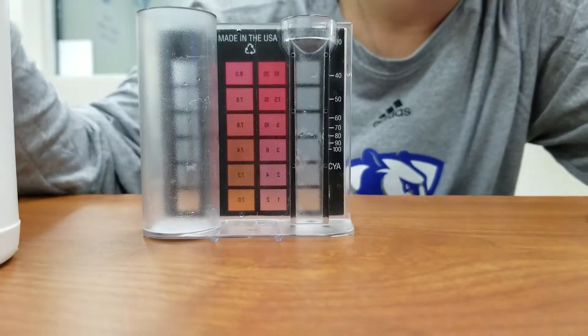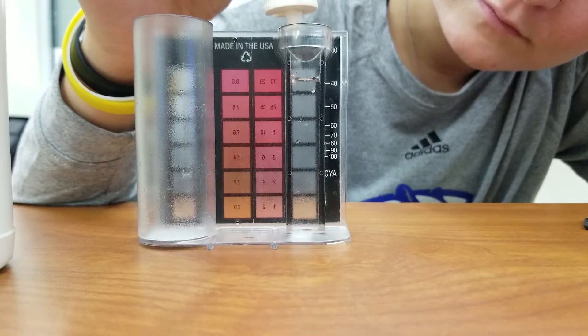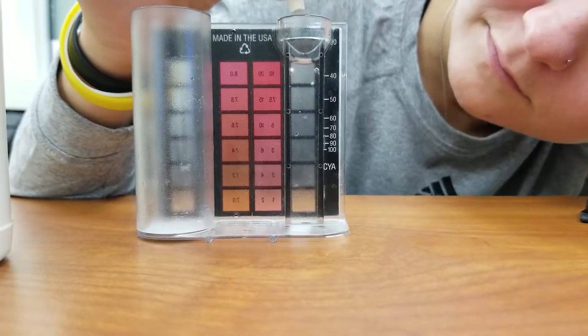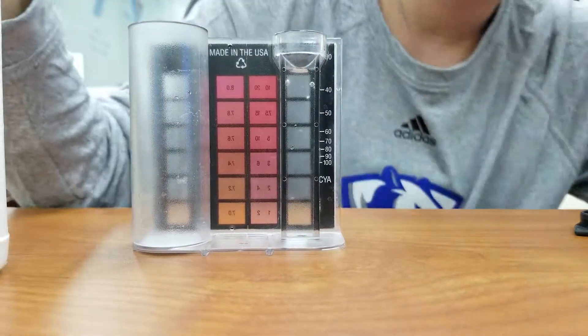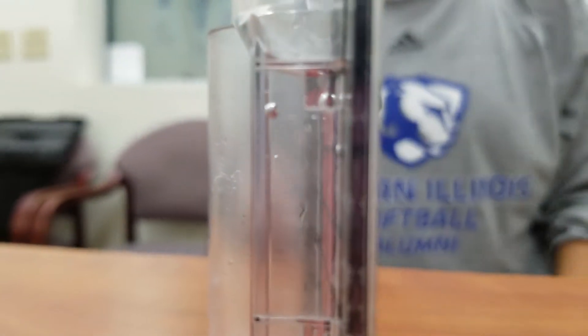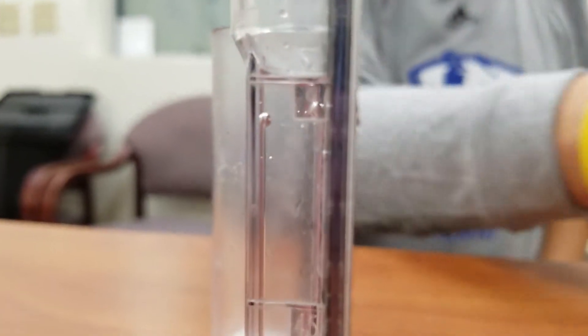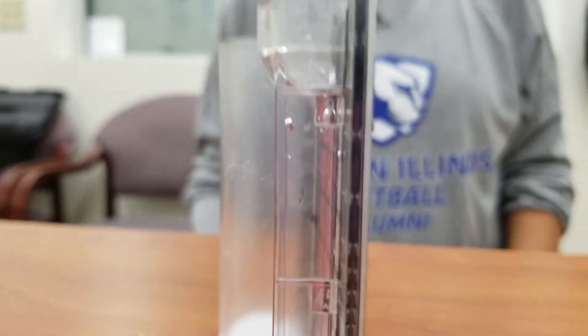Next up, we're going to test our total chlorine, which will also help us figure out our combined chlorine. We'll use the small side of the compartment or tube and go up to the 9 mark. If you see the little mark there, the bottom of the bubble, that's where we want our water line to be.